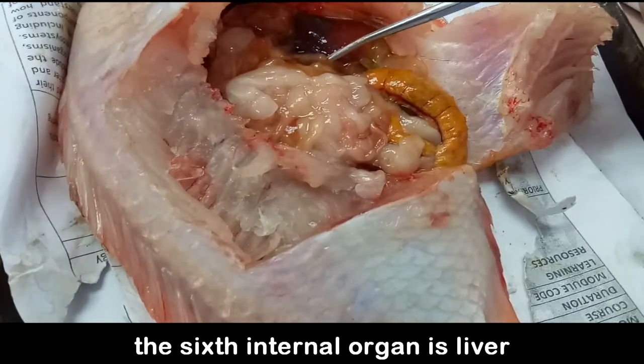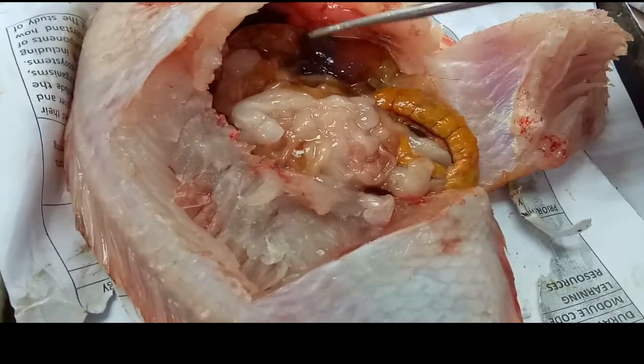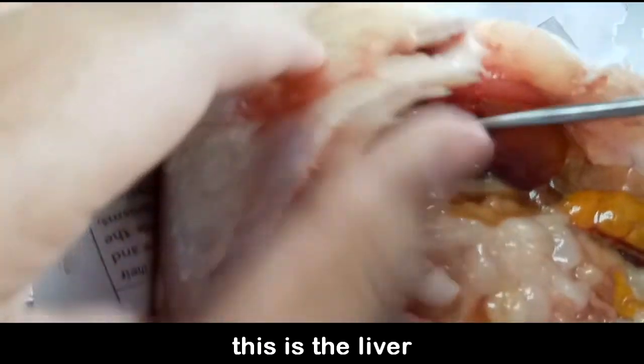The sixth internal organ is the liver. This is the liver.